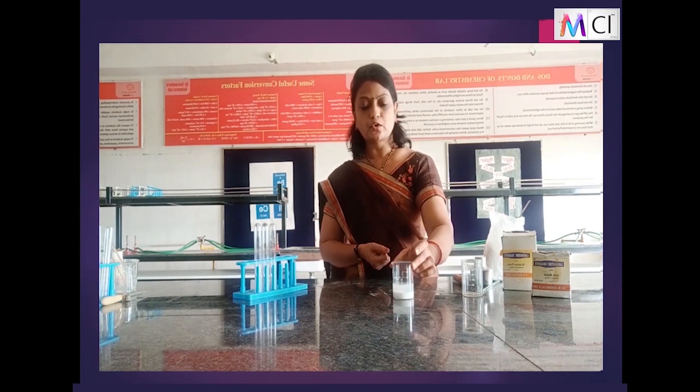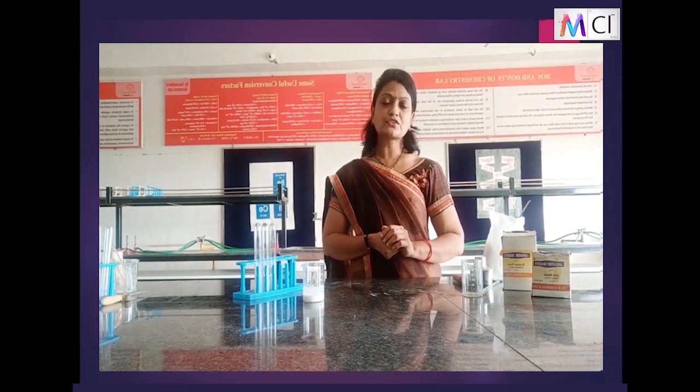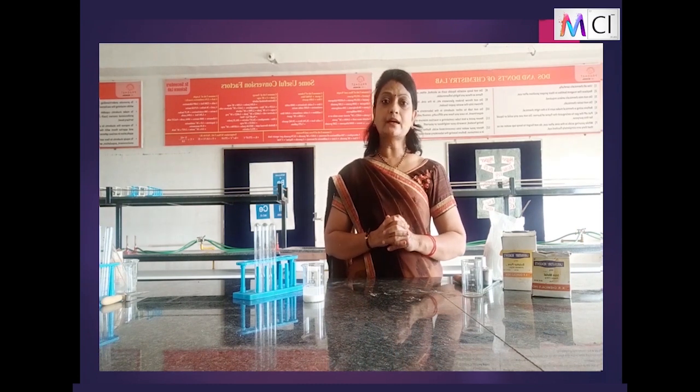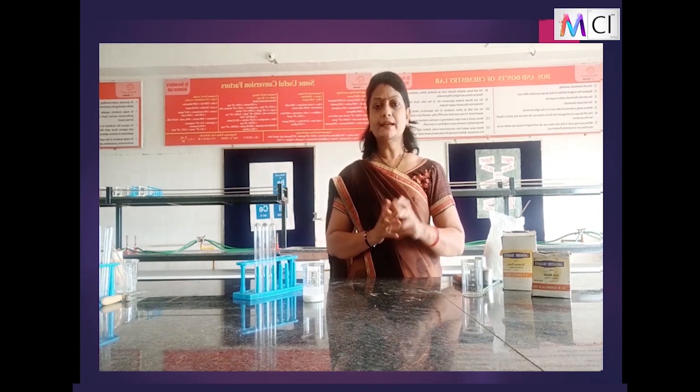Next reaction we will observe. But before that, can you write the reaction and show me for this reaction, children? Yes, CaO plus H2O gives Ca(OH)2, where we observe two reactants combine to form a single product, and along with that heat is liberated, so it is an exothermic reaction. Let us see one more example for this combination reaction.